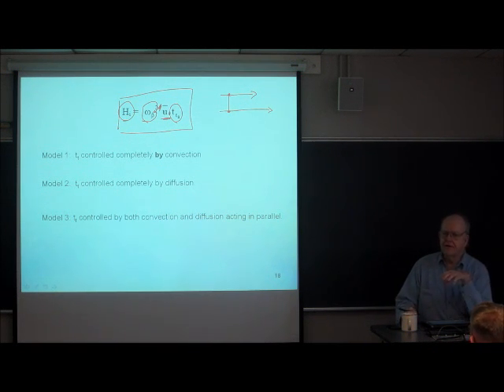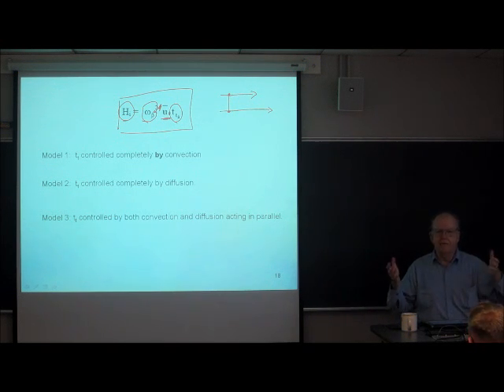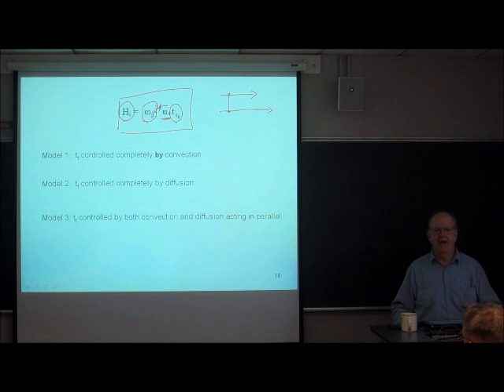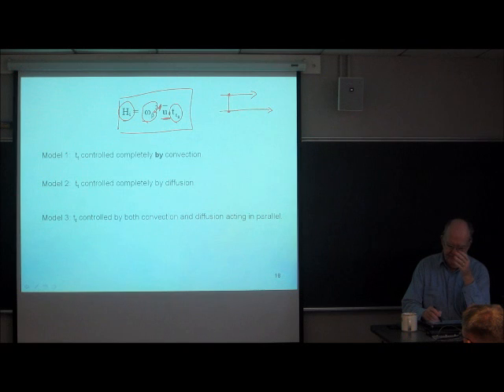Now this doesn't really tell us a whole lot, because what is the value of T sub T? And a number of people in emails asked me, where do you get T sub T from? And that's actually the next part of the problem. But there's 3 different ways that people over the years have estimated this transfer time here. And the first person to do it was Van Deemter.